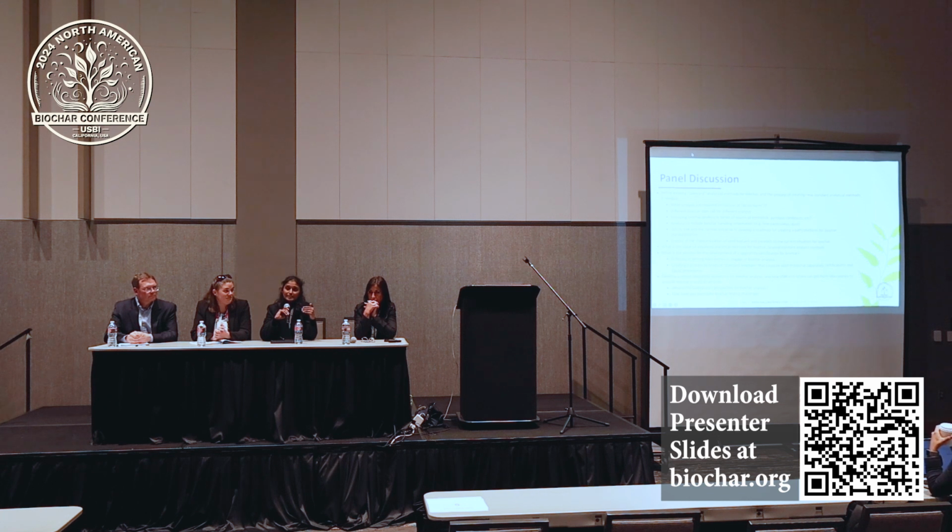Of course, there would be at least 3 different points we take in order to make sure that it's within the correction factor. So it's the same standard method. It's a 105 degrees oven, unless it's inherent moisture, which is a different story. For inherent moisture, that's 40 degrees. So it depends what type of moisture we are looking for as well.